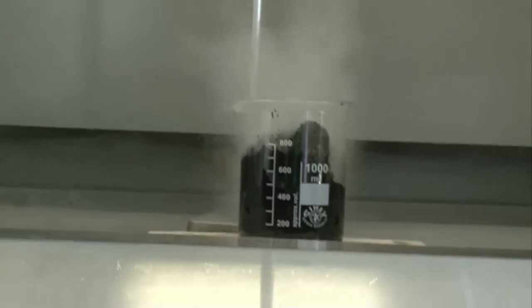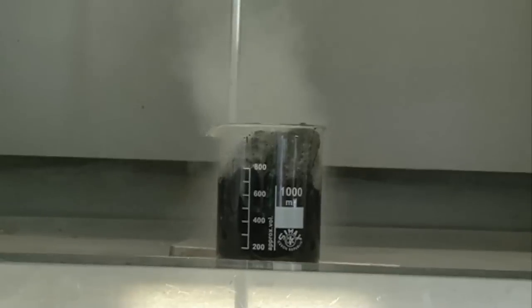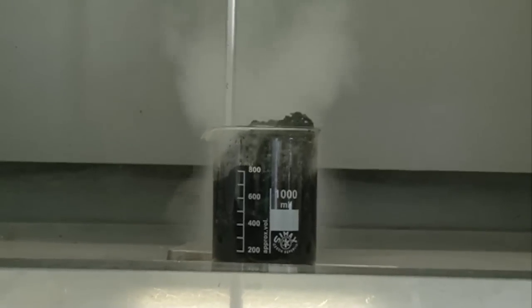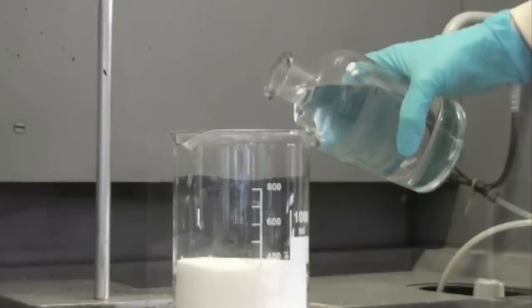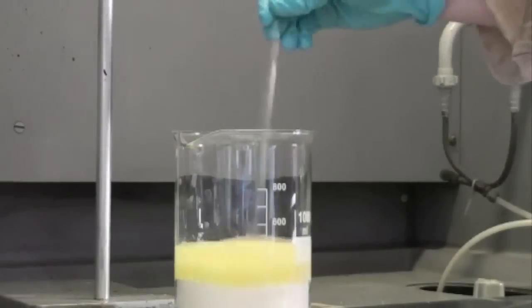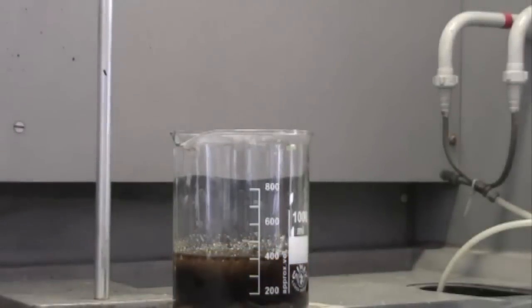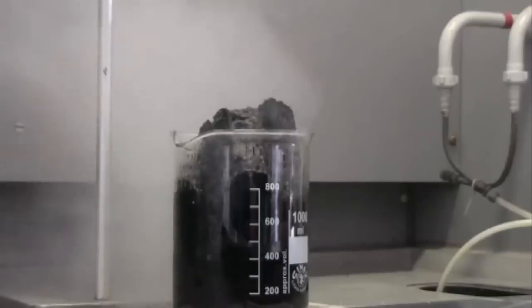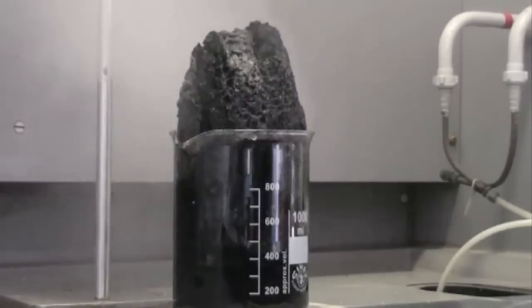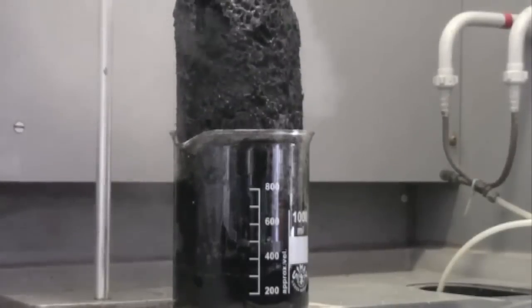It's getting hot, okay? You can see it's getting hot. The reaction started. We now have a column of carbon appearing out of the top of this beaker. Wow. Pretty freaky, isn't it? Okay, so you can see the steam coming off of this. This reaction is absolutely boiling hot.